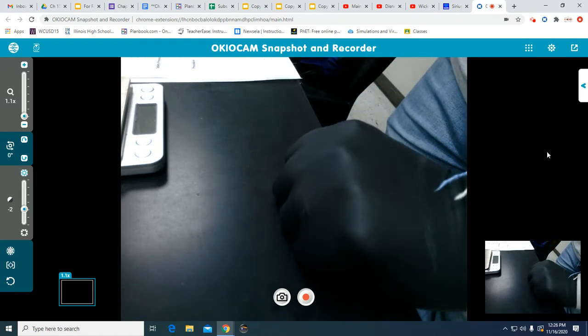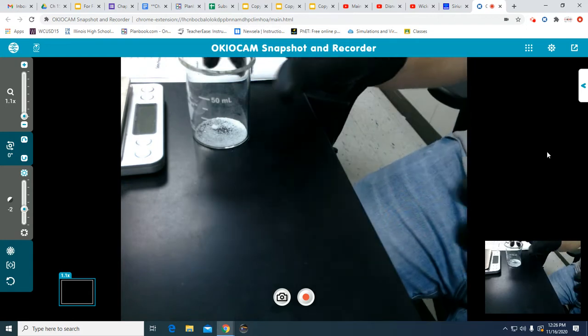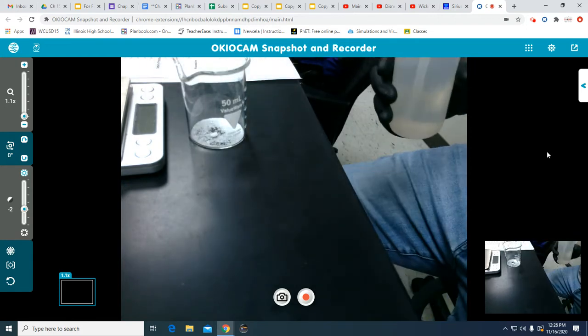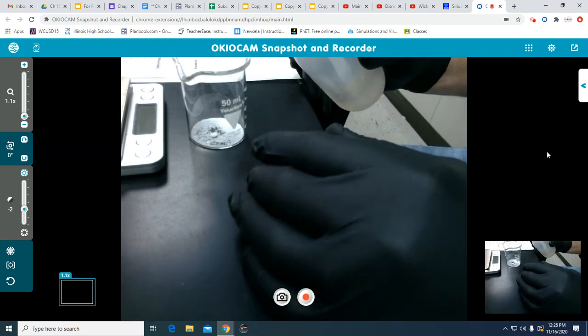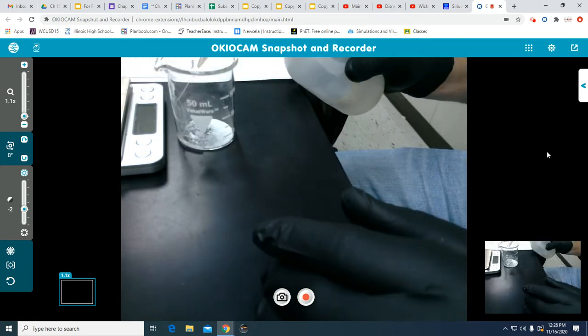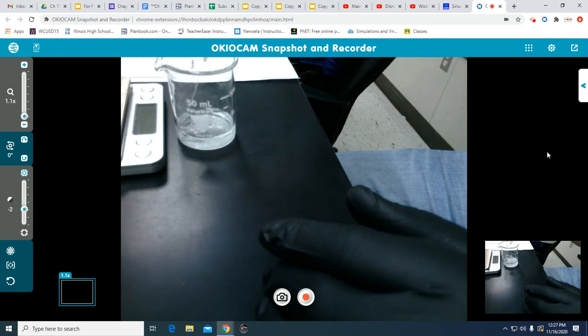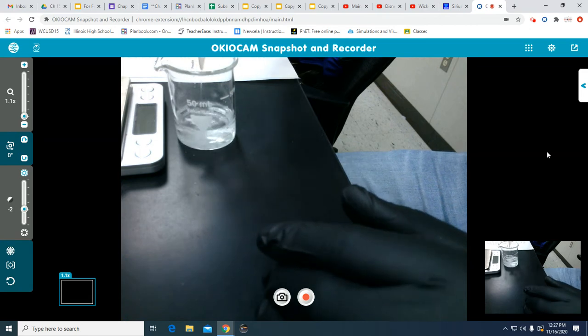Step 3, we are to fill the beaker that we just had our silver nitrate solution in to 30 milliliters. And I'm using deionized water. So we are going to fill it up to the 30 mark. I'm using this rinse bottle because it allows me to keep really good control over the amount of water that's going in there. And I can also begin to use the pressure from the bottle to help stir things up.